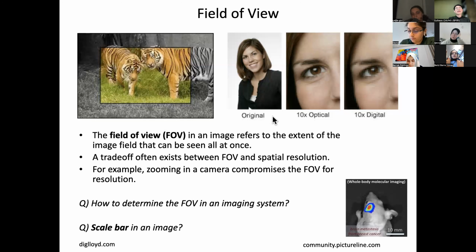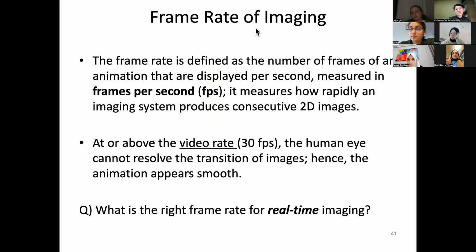Okay, and one thing here is the original, 10x optical versus digital. Digital zoom actually does not provide more information. That's why optical zoom is there. And in fact, you pay more money for high optical zoom, which optically makes your resolution better. That's why.